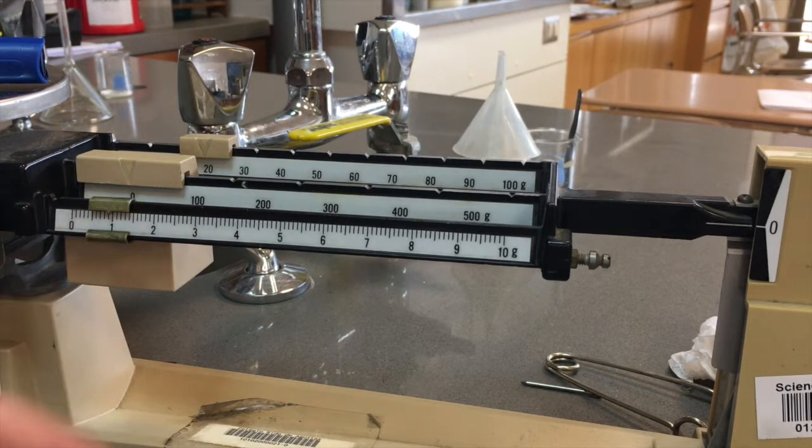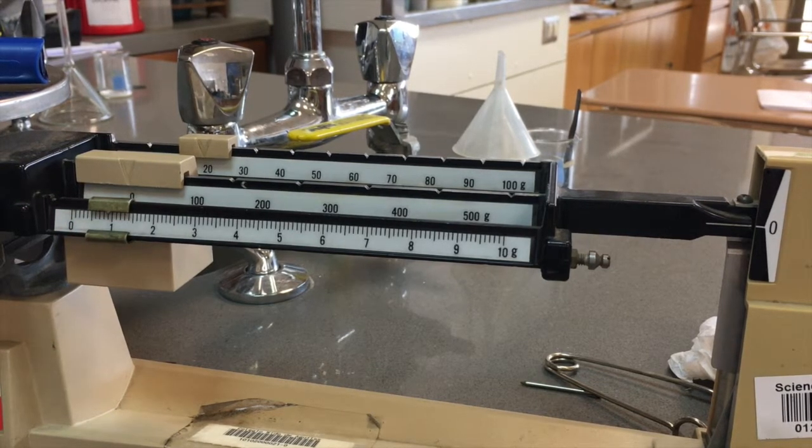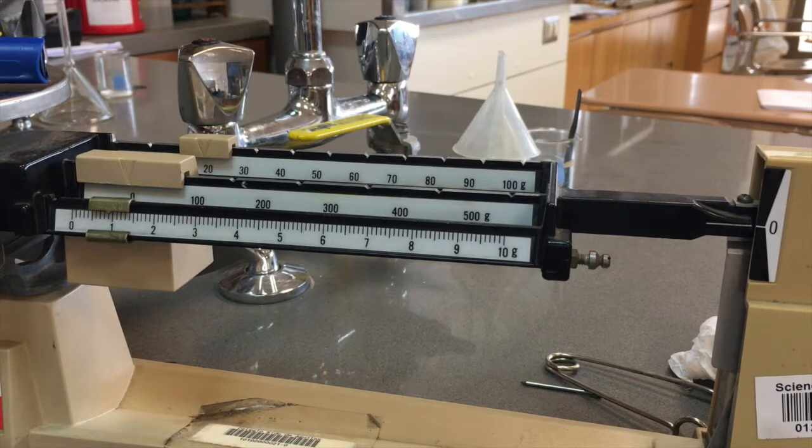You want to make sure that you don't get any systematic error. Systematic error is when you always make measurements that are either too high or too low. You want those lines matched up.